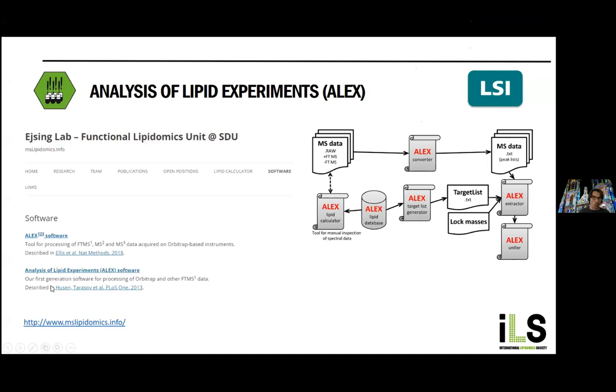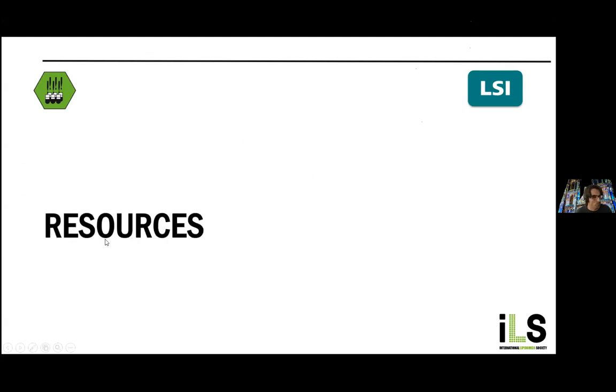We use it for our Orbitrap data, and there you can extract data from these experiments, and we programmed some Excel macros here also to deconvolute this data a bit more. So you see, basically there is no perfect software piece. Maybe the Lipid Explorer could be recommended here, but you have to try and really make your own picture from that. So finally, some resources.